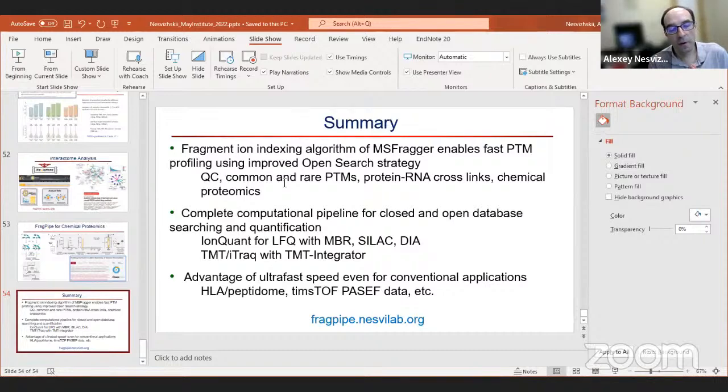If you look at the signaling pathways from, say, differentially expressed phosphosites in DIA versus DDA, those would show a comparable picture, and the number of missing values would be less by the nature of your more targeted extraction of quantification. But I don't know. I think it's a work in progress. I think more needs to be done to see how accurate we can be with DIA, specifically for PTM-containing peptides.